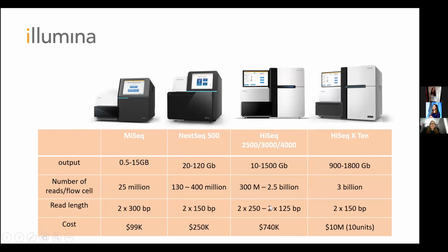So there is a wide variety of sequencing devices. The overall chemistry is very similar, but some of these use 4-channel sequencing chemistry like HiSeq and MiSeq, and some use 2-channel like NextSeq, MiniSeq and NovaSeq. The main difference is data output and read number.